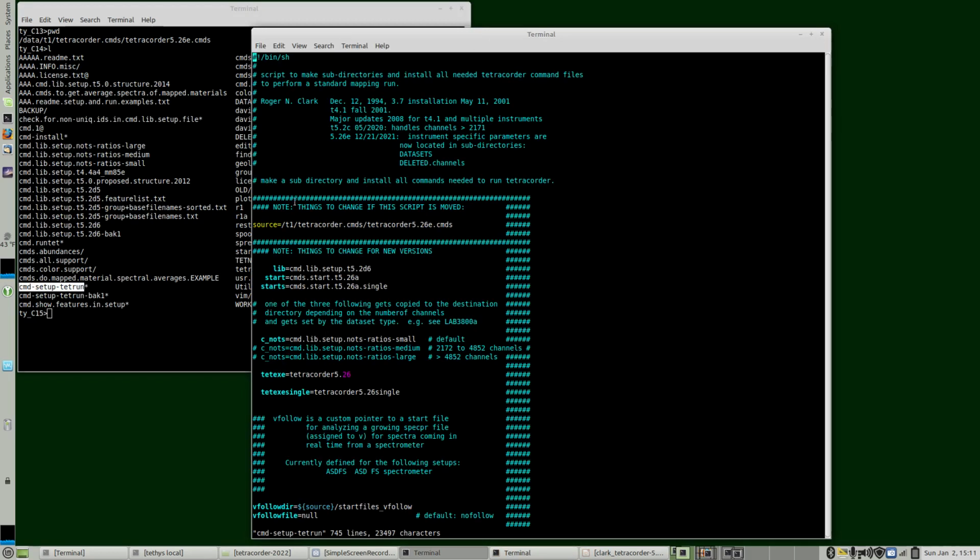And that's basically pointed to by, if you change the directory, you change this line, and if you change which command file to use, you'd change all of these in this directory. So that's the actual library.